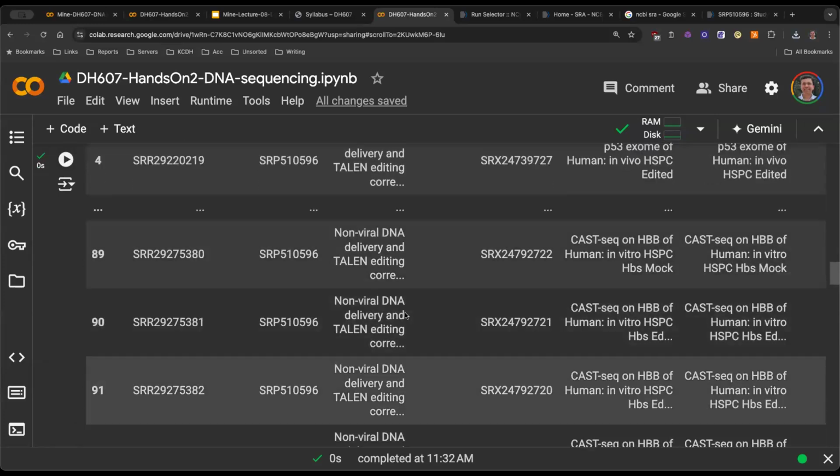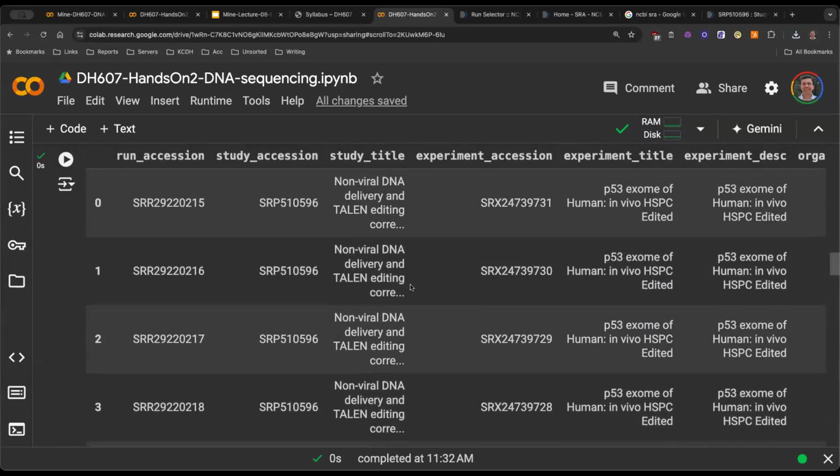You can write this to CSV, put this up in Excel, and do your sorting and so on. I did not put this package here just because I wrote it, but I think it's really useful, and I hope people who are going to work on projects will find it useful. Just to make sense of what exactly you're looking at: right now you're looking at 94 experiments.